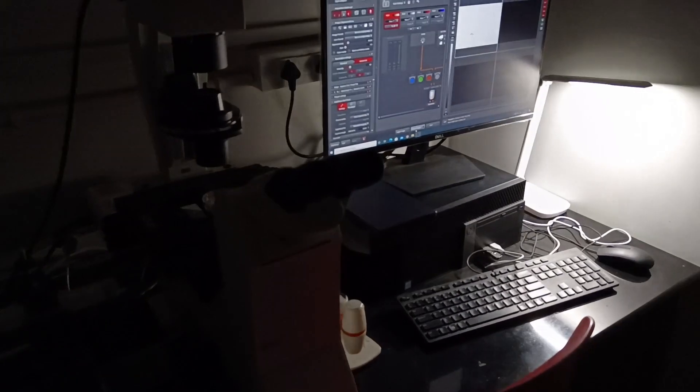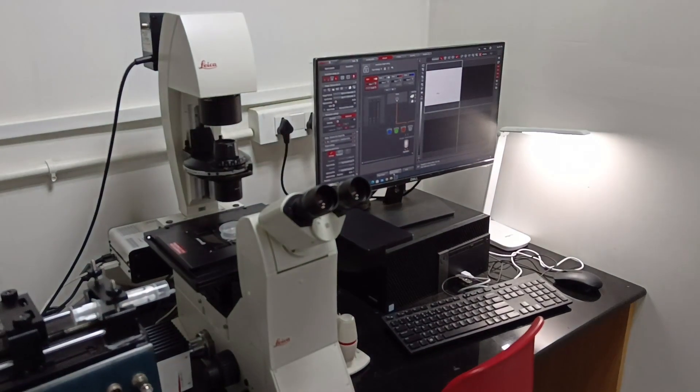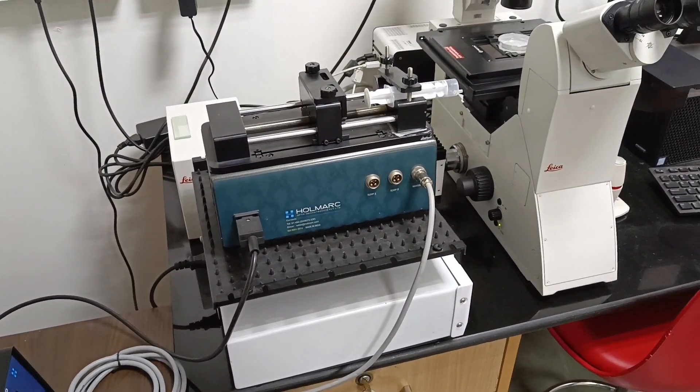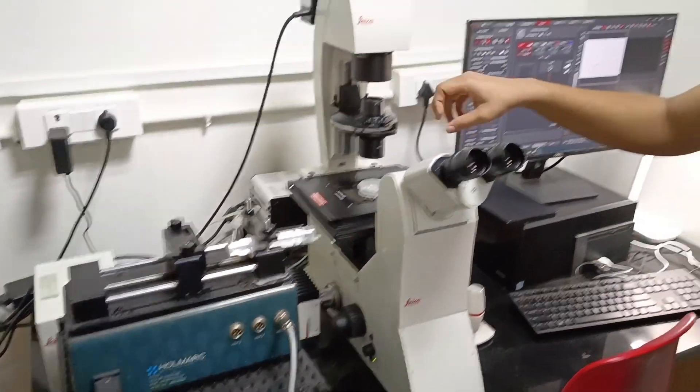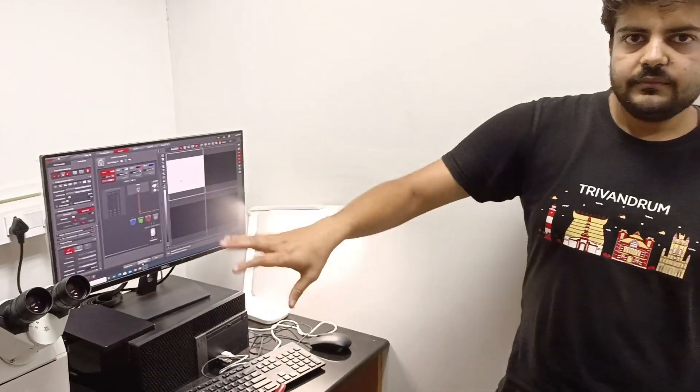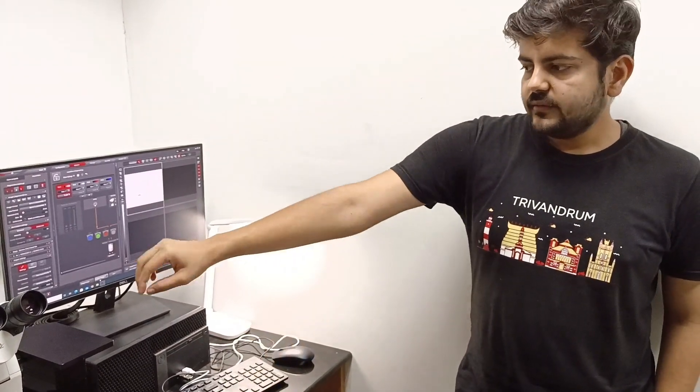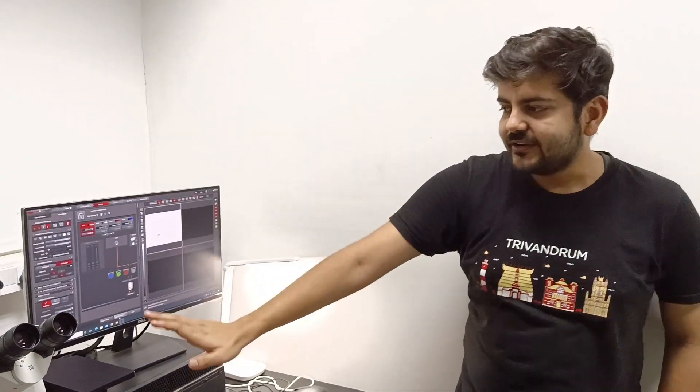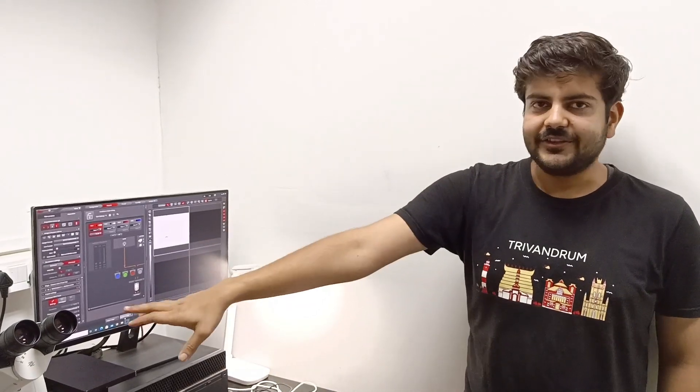One more thing. This setup, we also have this microfluidic setup. What we do is if you have to make the experiment automated, you can just put on, we have those devices, microfluidic devices. We can load the worms on them in thousands of numbers. And then we can just basically set the experiment and it will go on for 8 hours, 12 hours, one day, two day. This has been the setup for my masters, essentially. Most important instrument for my masters thesis, because all one year, actually more than that, whatever experiments I have done, I have done here. Ultimately, the data-generating stuff is this.